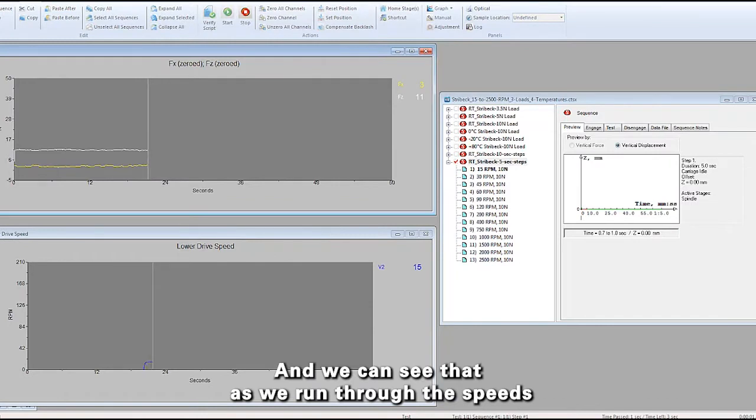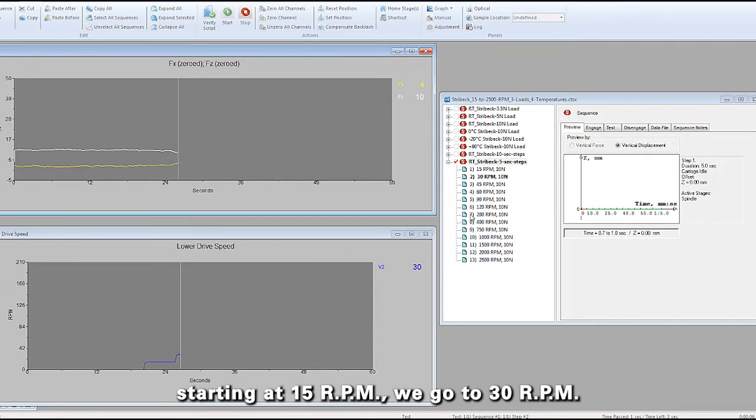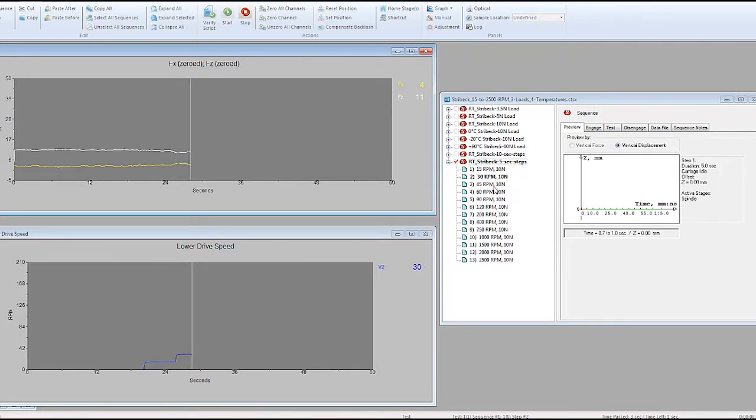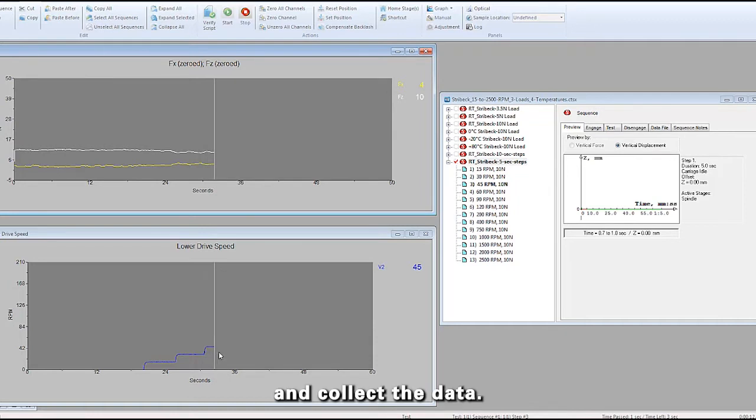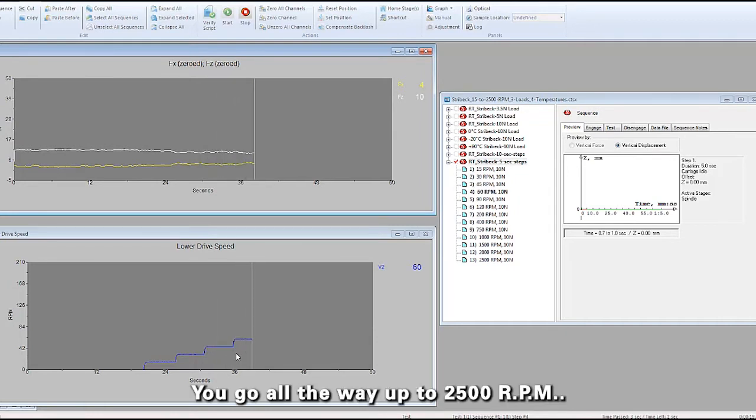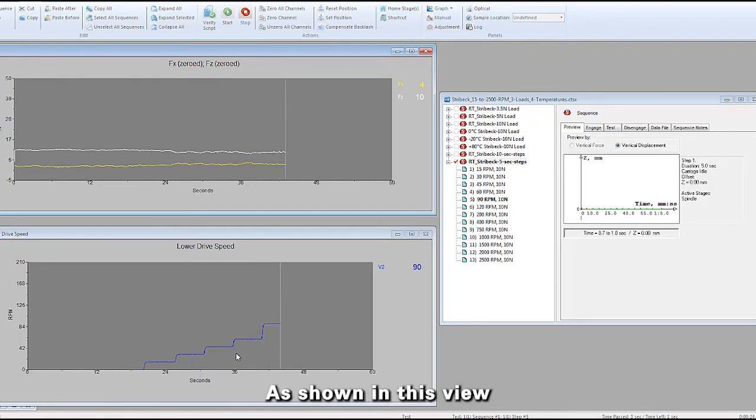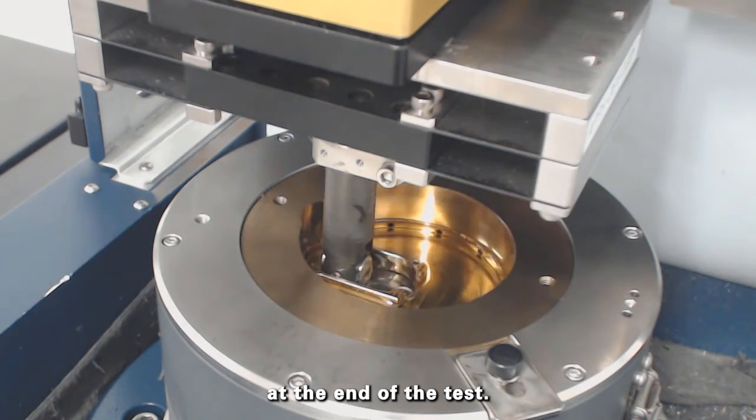You can see that as we run through the speeds starting at 15 RPM, we go to 30 RPM, then to 45 RPM and collect the data, going all the way up to 2500 RPM, as shown in this view at the end of the test.